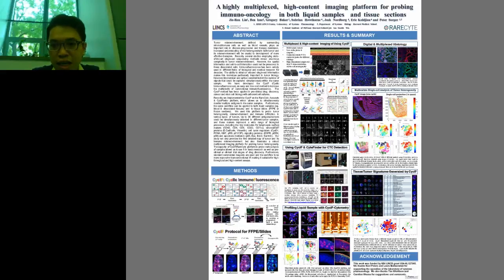In a simple case, as you can see right here in the method part, we first do the nucleus stain with the fluorophore. Then we do what we call the fluorophore bleach inactivation method. Now you can stain for 4 different antibodies in the same cell. You can see that now it changes to a cytoplasmic stain, although you probably cannot see in detail what antibodies we are using.